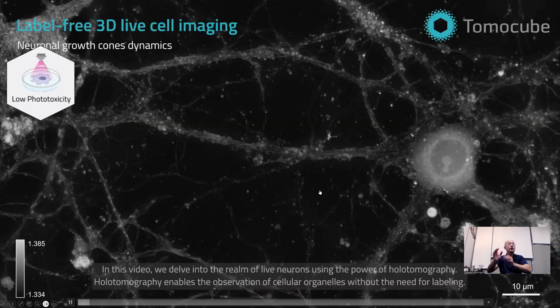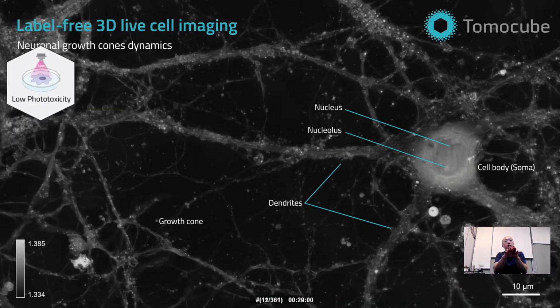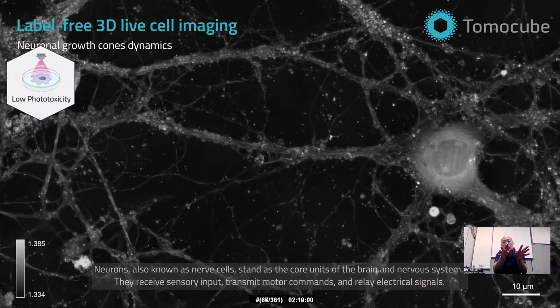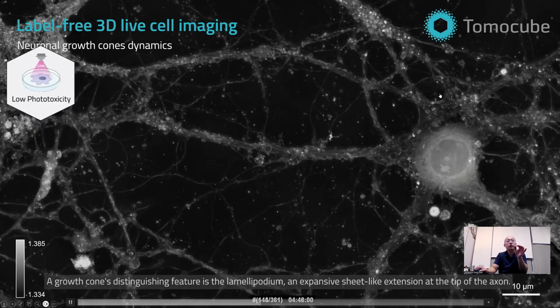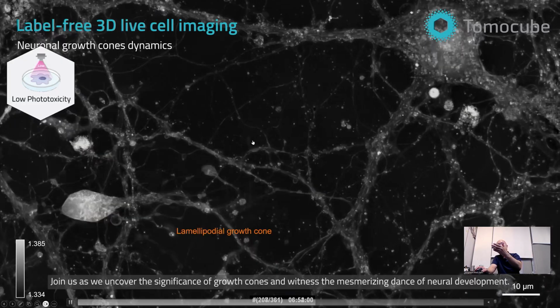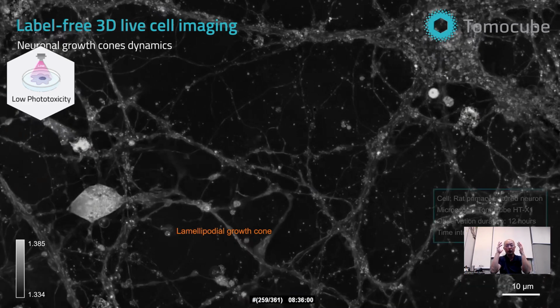So what you are seeing here is a three-dimensional tissue culture of neuron cells. You're watching not artificial neural networks. This is real biological neural networks. You can see the individual neuron cells are connected by axon and dendrite structures, and you can see this neuron is trying to make a new connection. This is remodeling, or plasticity, happening in your brain right now.